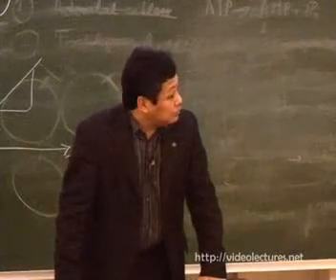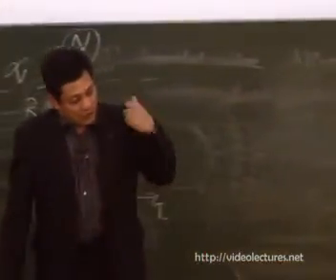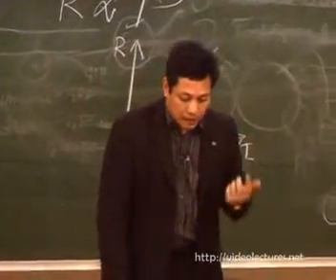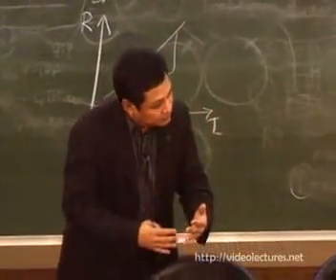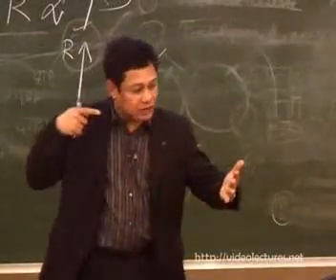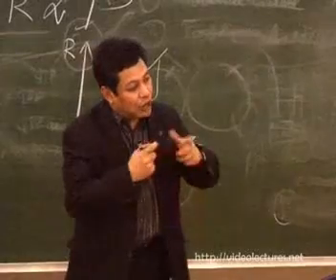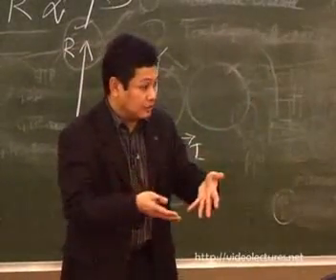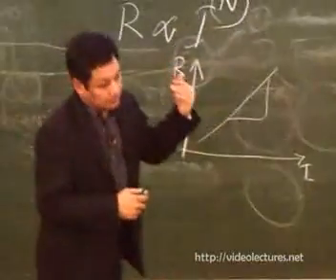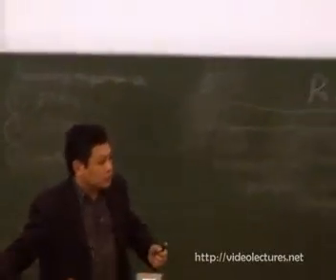And these molecules are very strong. You have to remember that people get confused about this. We also work with carotene from carrot and chlorophyll. I found out that the molecules that we synthesize are weaker, and these molecules are extremely strong. If you try to crash with the tip, you cannot easily destroy them. You destroy the tip, not the molecule, because they are carbon-carbon bonds, and carbon is very strong. The tip is metallic, in this case coated with silver, because we crash the tip. And if you don't put water, then these molecules survive very strongly. That's why they are naturally selected over billions of years.